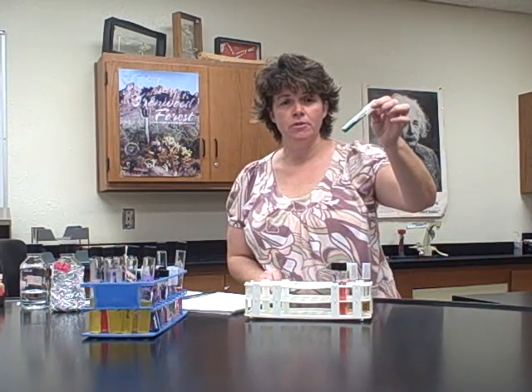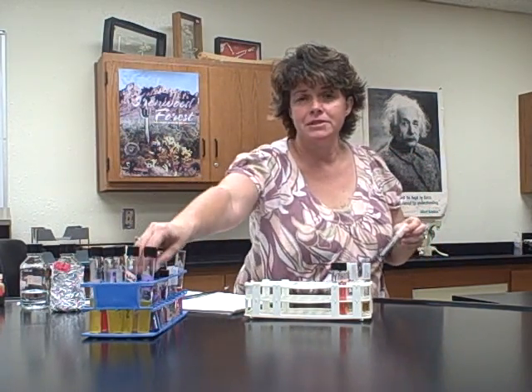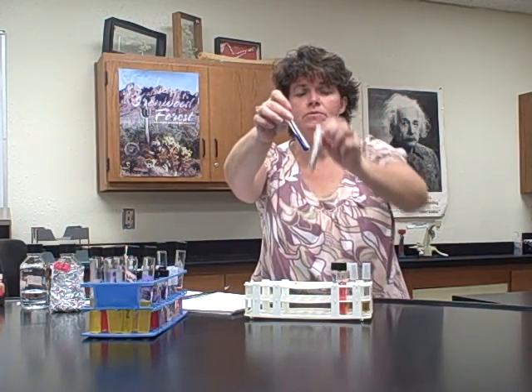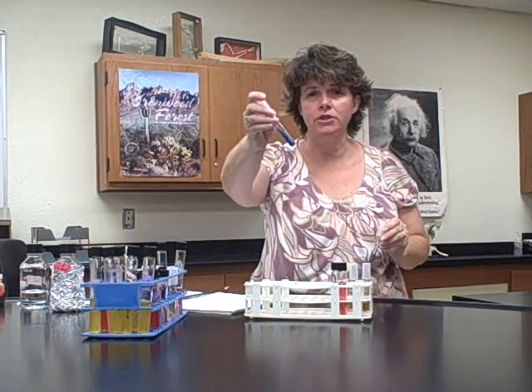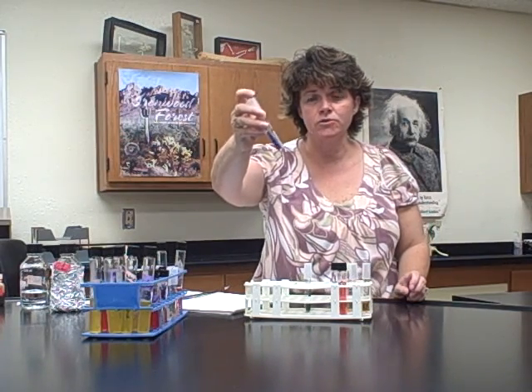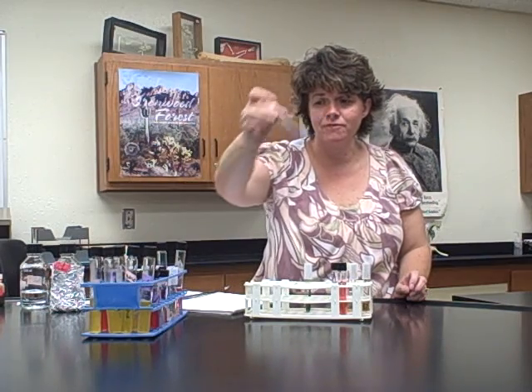The other one was I asked you to inoculate the Simmons citrate tube. So this was the green tube. And if you refer back to page 107, you learned that the Simmons citrate will turn blue. Hope you can tell the difference. Will turn blue if that bacteria uses citrate, citric acid, as its sole source of carbon. So this one is a positive for citrate.